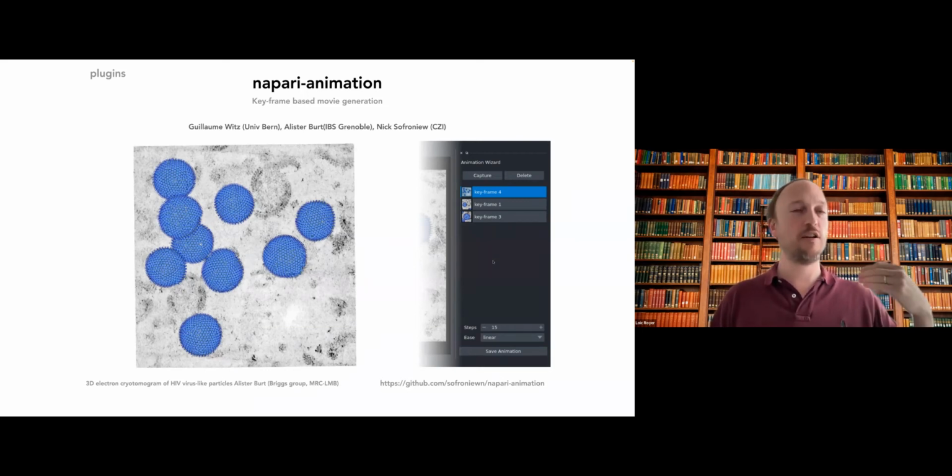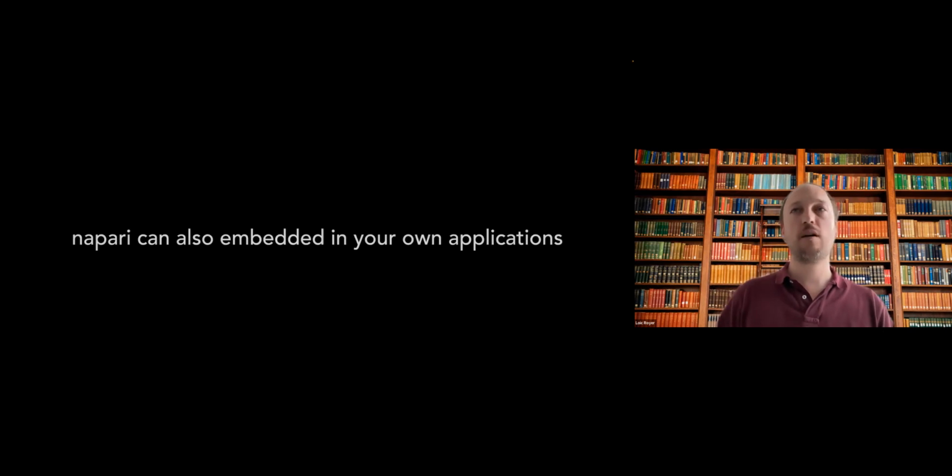But I think the path forward is really to iron out all of these things and make it every step of the way easier and easier to use. And I think we are doing great work towards that goal. So it's very exciting. In my team, we have also been using Napari as a library that you can use to embed a viewer within your own applications.